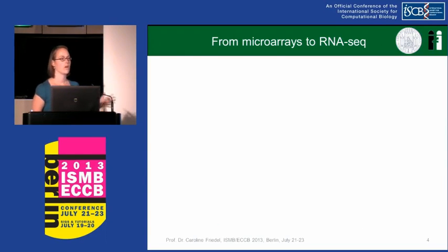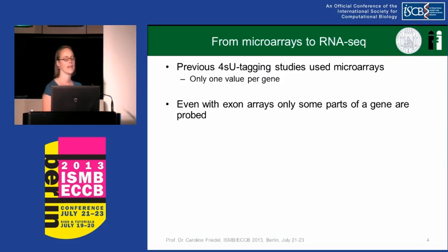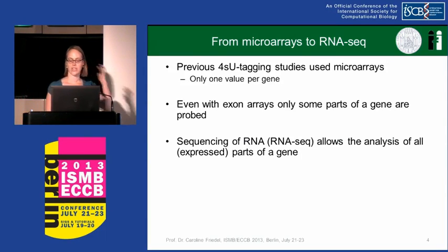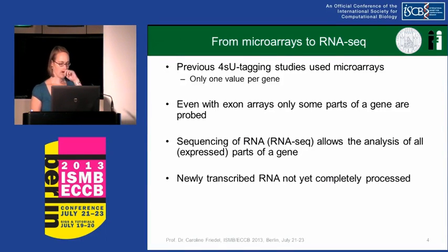Previously, we already did a few studies using this RNA tagging method. Previously we used microarrays, but as you all know, if you use microarrays you only get one value per gene, or if you use exon arrays, you get only some parts of the gene which are probed. Whereas if you do sequencing of RNA, you actually get the expressed parts of the gene, at least those which sequence well. And if you combine this with tagging of newly transcribed RNA, you can actually see that the newly transcribed RNA is not yet completely processed.